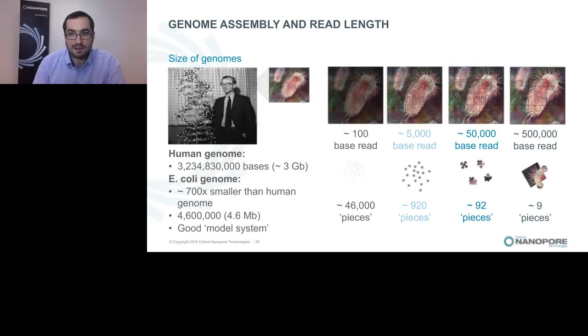So I'd like to finish now, in the time I've got left, with a few applications of the technology. Firstly, I'd like to talk about de novo assembly of microbial genomes. Using short read sequences to try and assemble a genome is like taking, say, a jigsaw, or rather, because you want 30x, 30 copies of the same jigsaw, only with each one cut slightly differently, and then all the pieces mixed together.